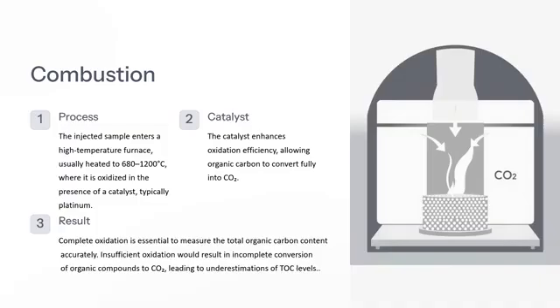In step 6, we have combustion, which is also called oxidation here. Inside the furnace, the sample is subjected to temperatures ranging from 680 degrees centigrade to 1200 degrees centigrade, often with the aid of a platinum catalyst.